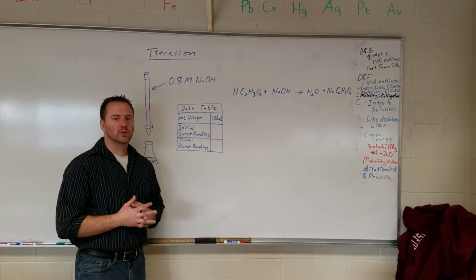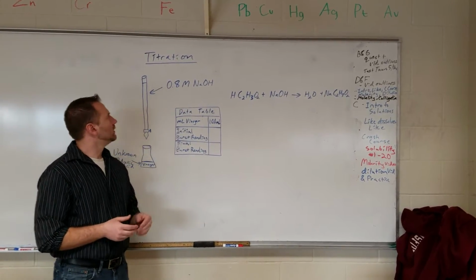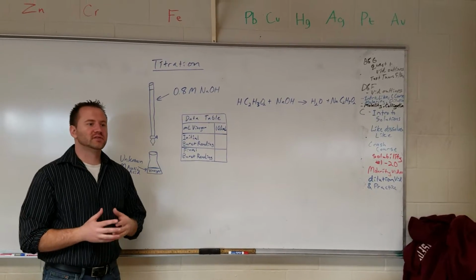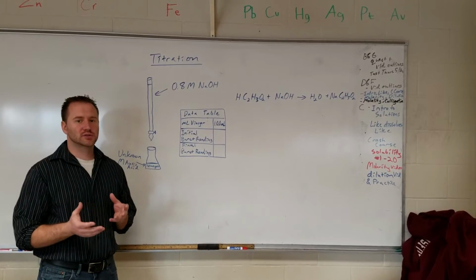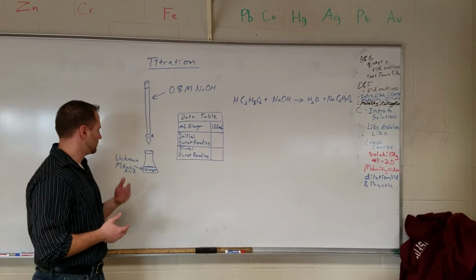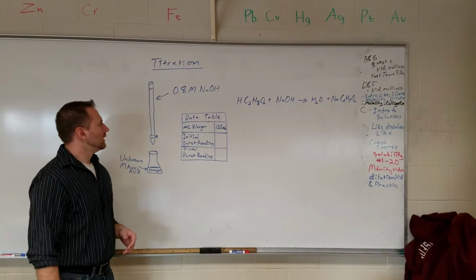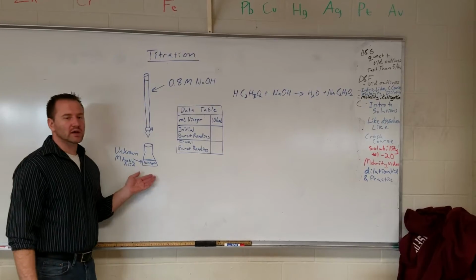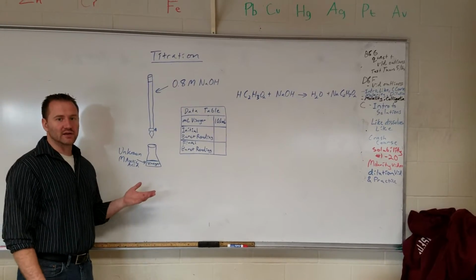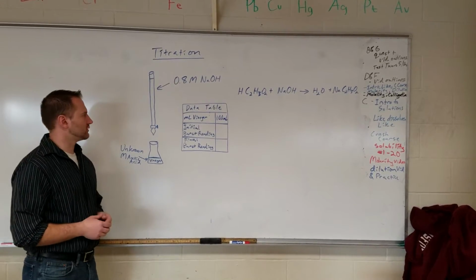Today's video, we're going to go over what titrations are, and then we'll actually perform a titration as well. A titration is basically a laboratory procedure used to determine the concentration of a sample where you know it contains something and you don't know how much of it contains. In this one, we're going to do an acid-base titration where we're going to look at vinegar, and vinegar contains acetic acid, but we want to determine what that molarity is for acetic acid.